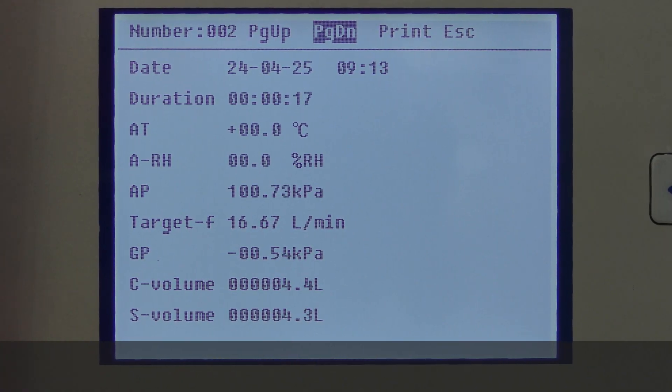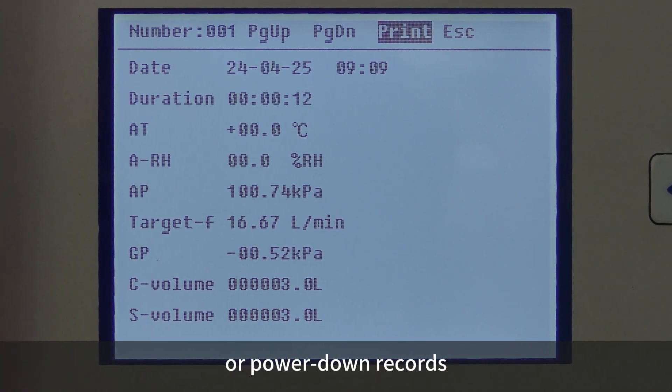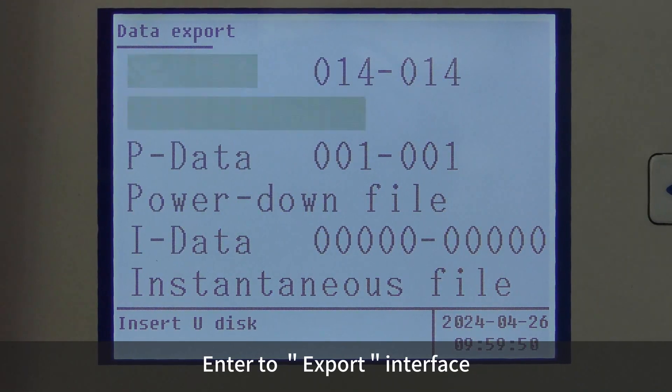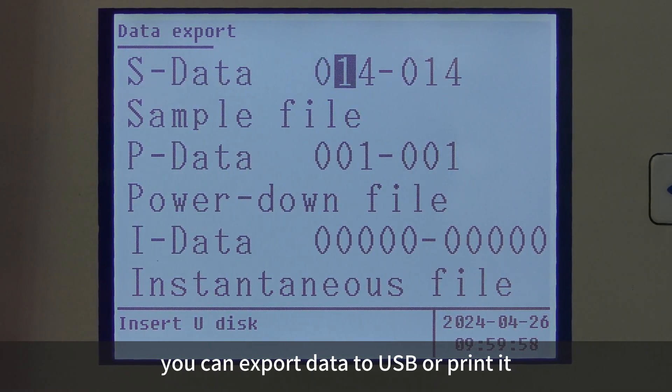Enter the query interface to find the sampling data or power-down records. Enter the export interface to export data to USB or print it.